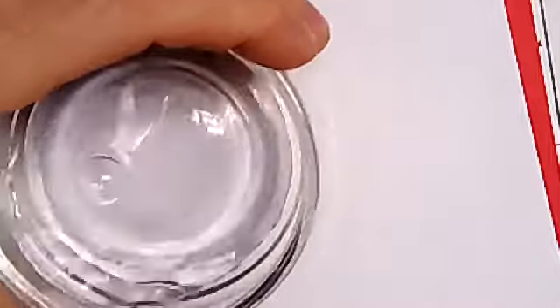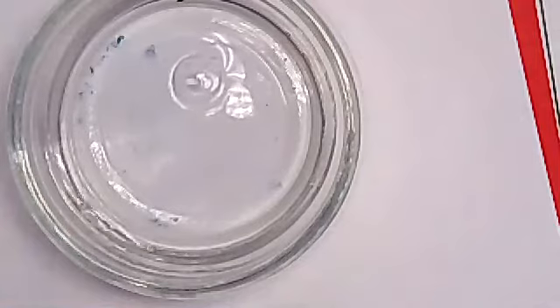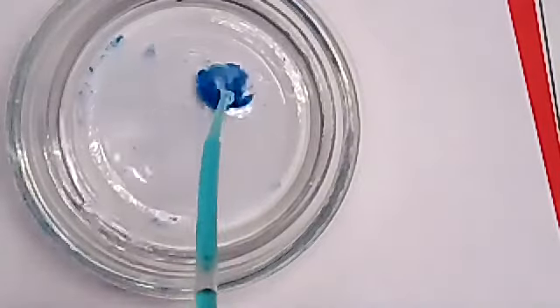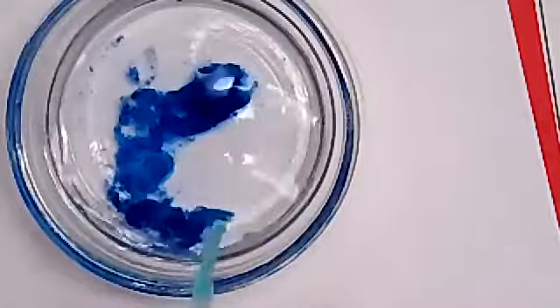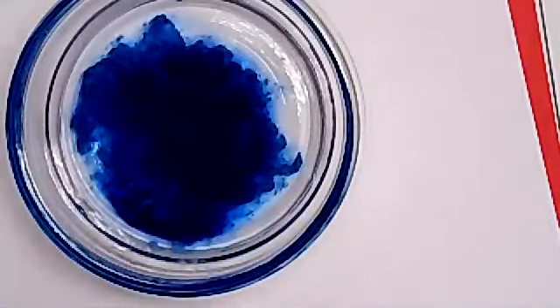So let me go ahead and add the ammonia into our dish. And there it is. Again, you can see it is a cleaning solution. It is a clear solution. And then I'm going to take a pipette and transfer some of the blue solution, our copper sulfate solution, into here. And watch what happens. Kind of spread it around. Now, I know it's kind of hard to see exactly what's going on. Let's see if we can get a little closer. There we go, that's about as close as I can get.